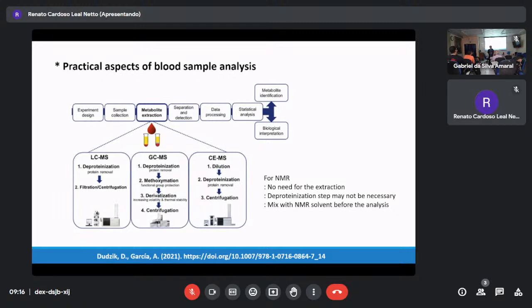Evaporation and reconstitution in D2O takes time, and during this you will probably lose a lot of compounds. With fresh water, the water signal is about 100%. So nowadays many people think we have to use deuterium solvent, but it's not true. We can add some for the lock.